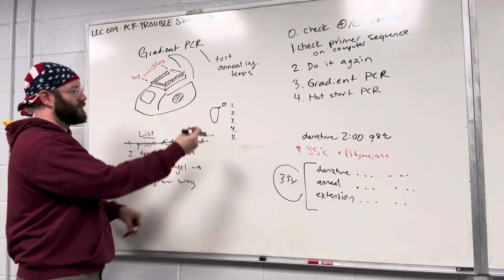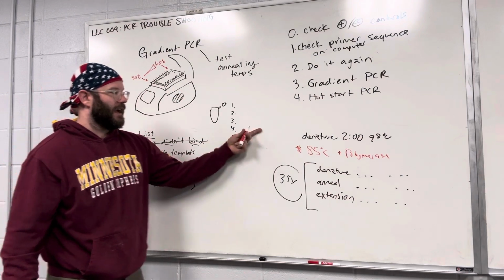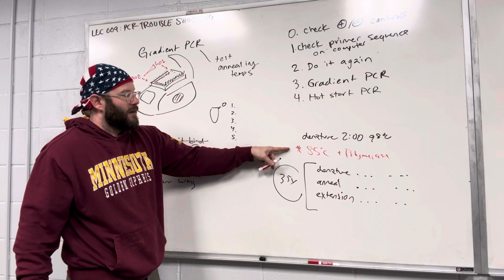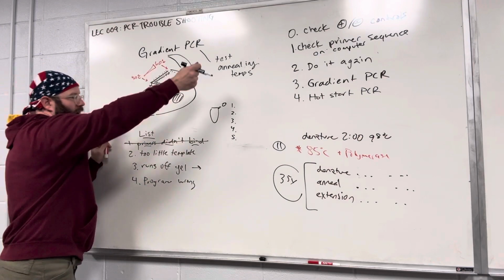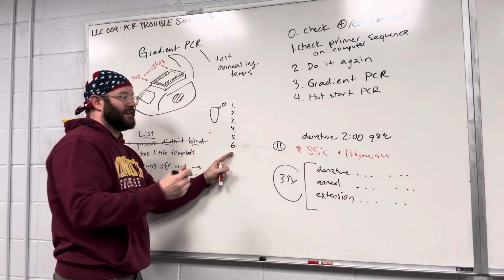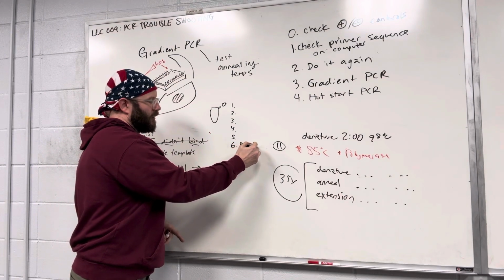And you close your tube after you put in the other ingredients, you put it in the thermocycler, and you run this program. It does an initial denature at 98, and then when it hits this step, 85, you can press the pause button on the thermocycler. You can open it up, you pull out your tube, you open it up, and then finally, only at that point, you add your polymerase.